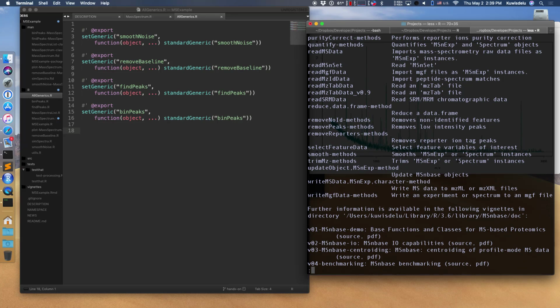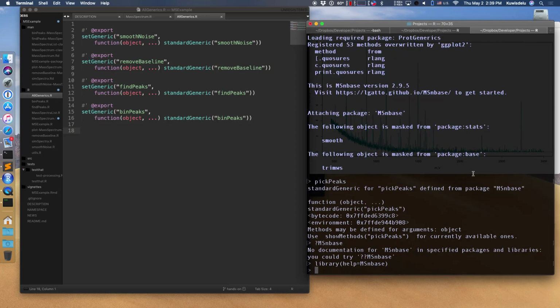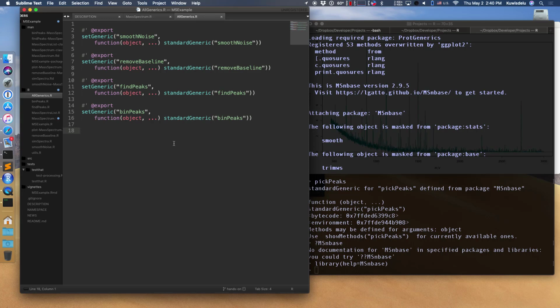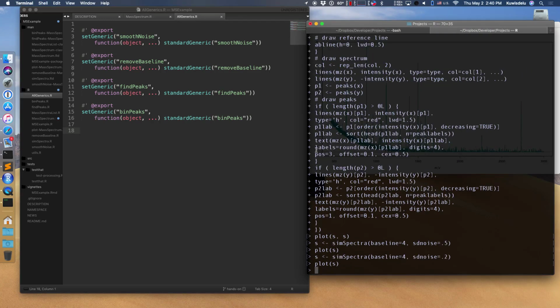Cardinal for mass spec imaging has its own versions of some generics like this. So the main thing I want to emphasize here is whenever you're doing something that probably has some existing infrastructure in Bioconductor or whatever ecosystem you're working with, it's always a good idea to reuse what is already there as much as you can. I'm kind of breaking that rule here just for simplicity, so this little example package doesn't have to rely on those packages. That's not necessary in this case, but it's usually a good idea to do that if you can.